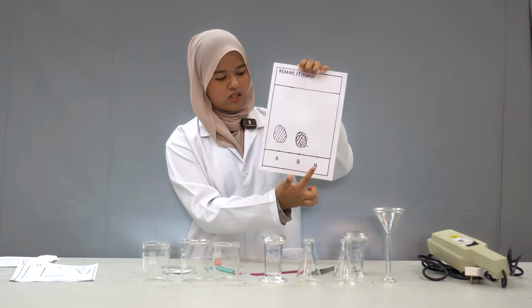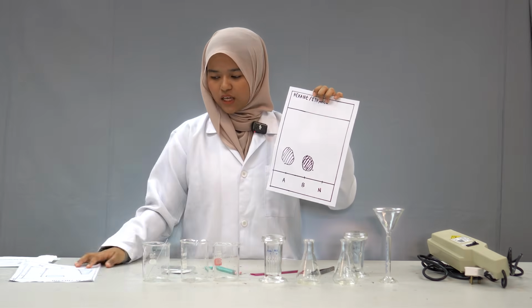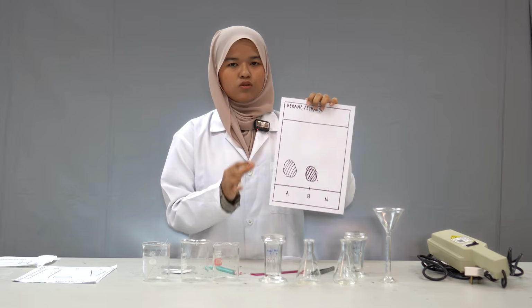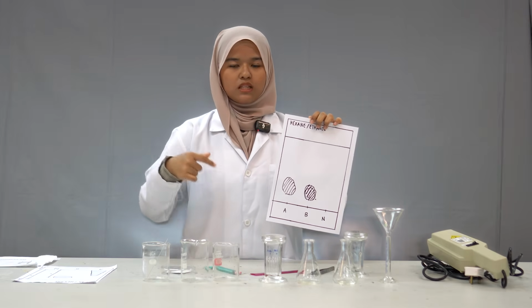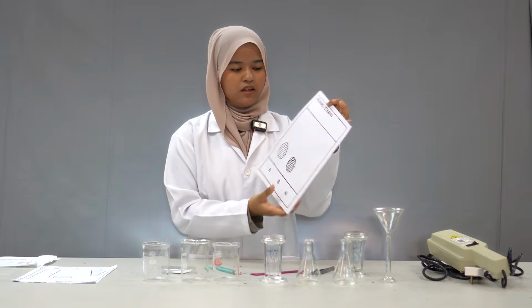As you can see here, about our neutral, you cannot see the neutral, right? Because our neutral is non-polar. So when it is non-polar, it will move the furthest away from this, so it will just disappear like that.